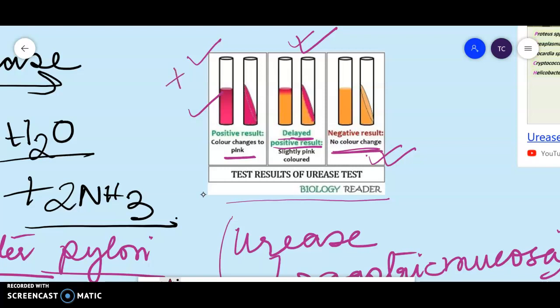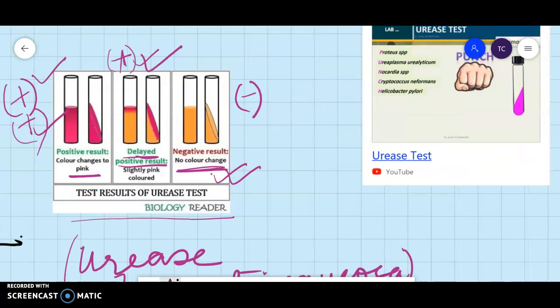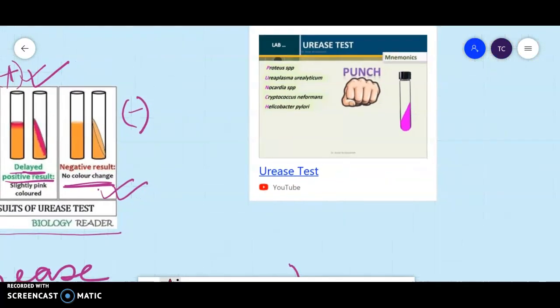So this is for the positive test. This is for the delayed positive test. I will take a double plus over here, for the delayed positive test, one plus over here, and this is your negative test. This is a small YouTube video.